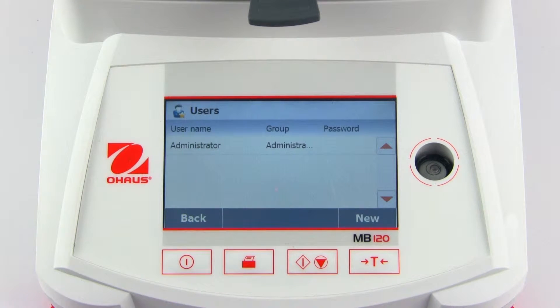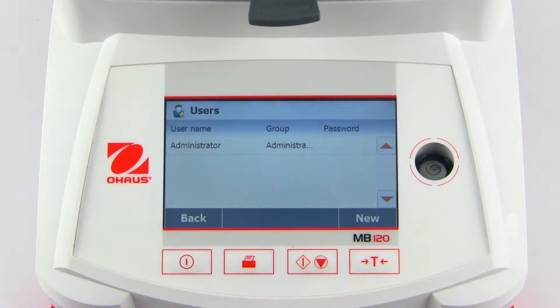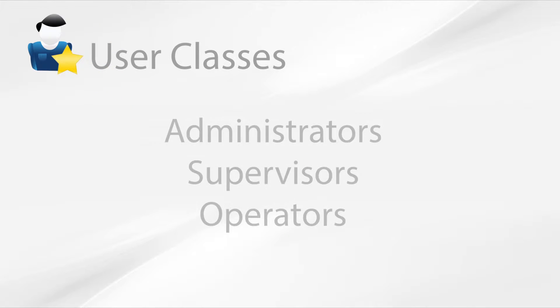As a default setting, a system administrator with no password exists. Initially, all users using the device will have administrator rights. Three classes of users are available: administrators, supervisors, and operators.